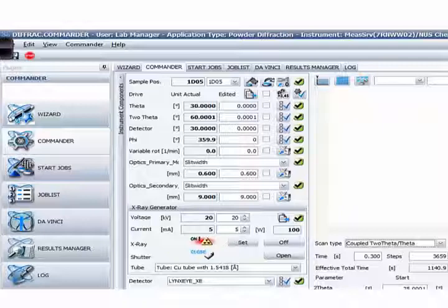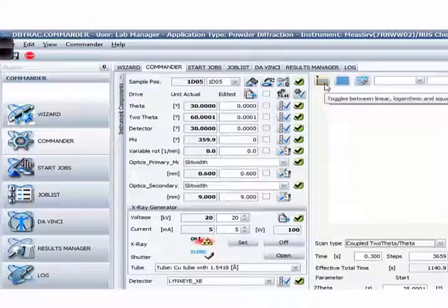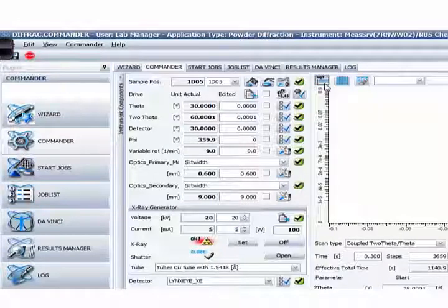When you're done with all the settings, just press this Start button. Anytime you wish to stop, press Stop — you can load your samples again and press the Resume button; it will not affect anything, so you can resume anytime. There's also an auto-repeat function — if you need it, you can select it. These controls here allow you to change the different scale for your X axis and Y axis.